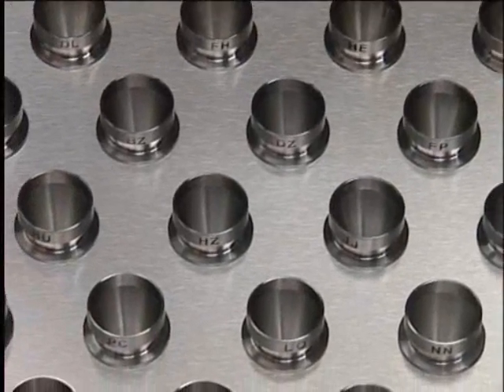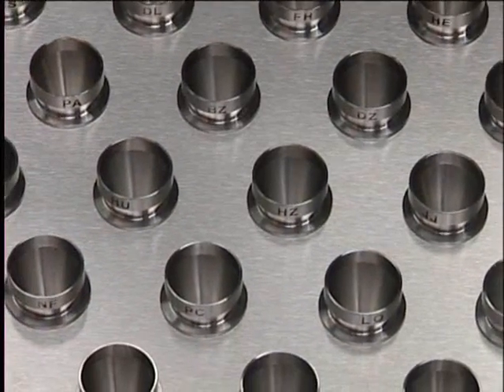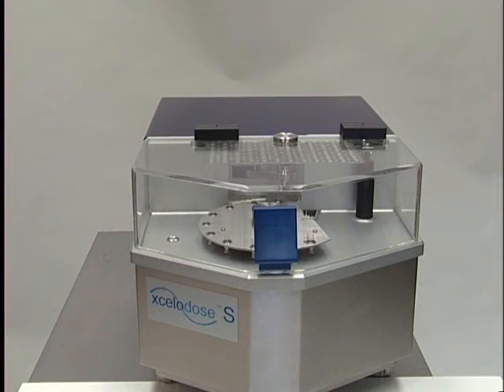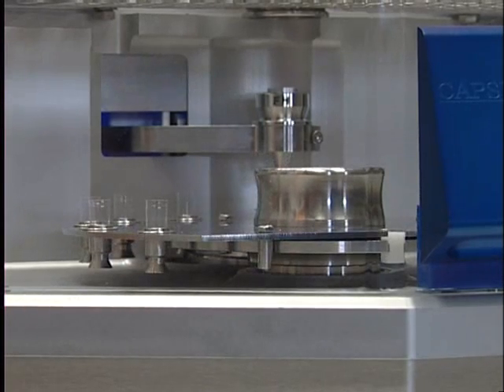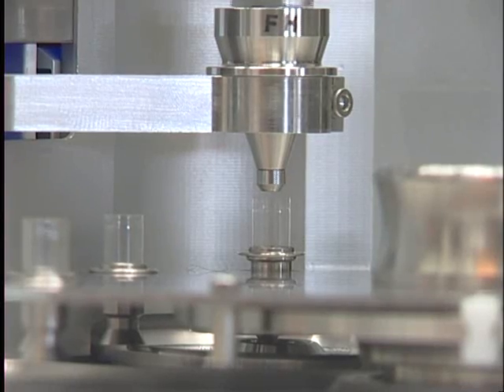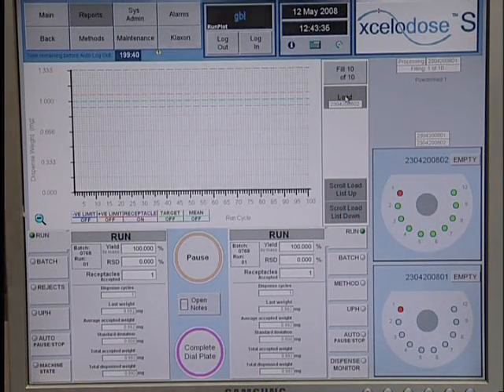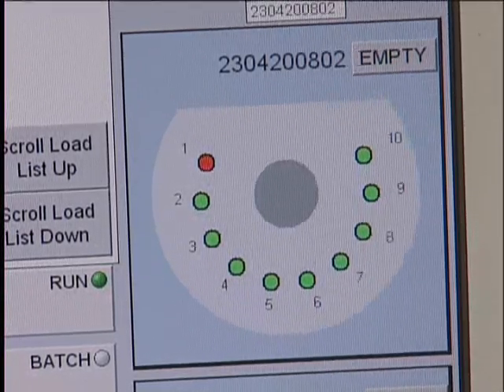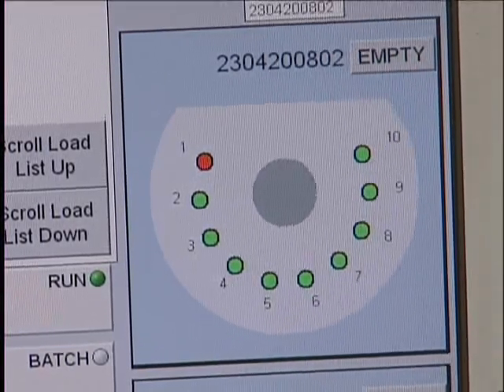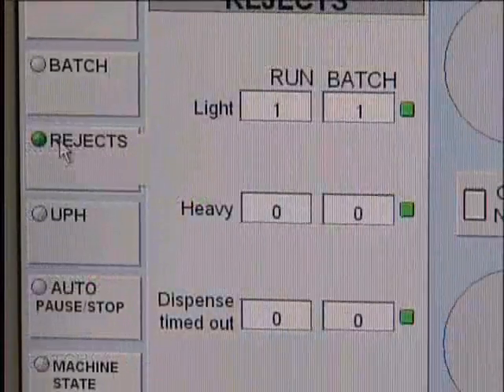Change parts are readily available for capsule sizes 0EL, 00 to 4. The user can choose between a 2g, 5g and 10g microbalance depending on weight of fill required, receptacle to be filled and tapper options. All product contact parts are fabricated from 316 stainless steel. The progress of the run is monitored by the graphic user interface. A green status indicator represents an accepted capsule, whilst a red status indicator represents a capsule that has fallen outside the target weight limit which the operator has set.